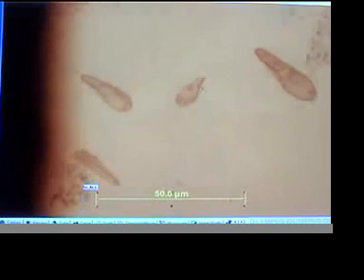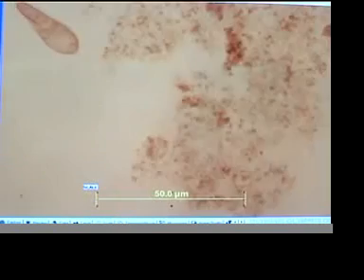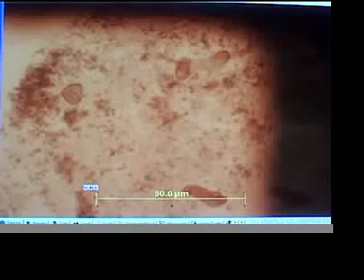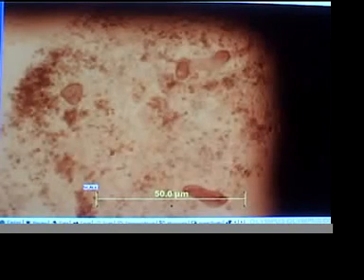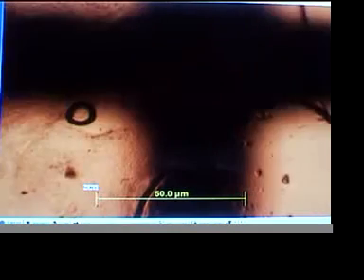Few. Oh, they're alive. 6F is doing fine. Something funny up in here at 6F. 6G, 2 guys. 6H, 3 guys. Let's go to 5. And of course, the swimmers are moving from square to square.